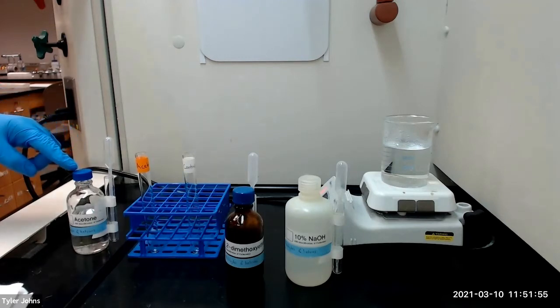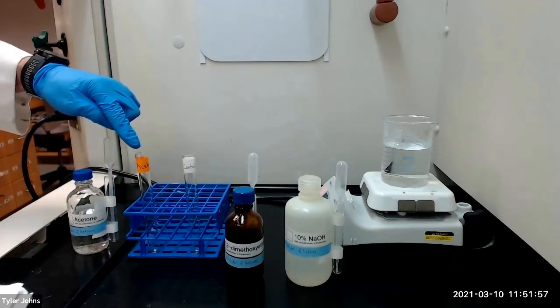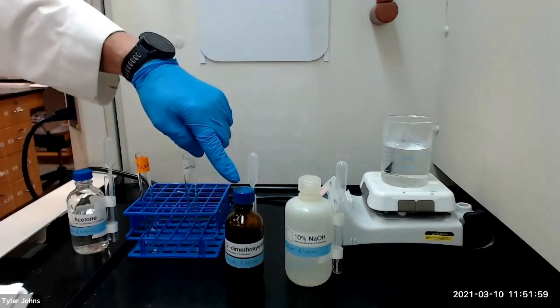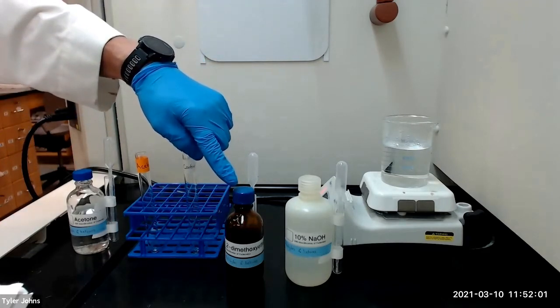We will begin by adding a small amount of acetone to a test tube and then dissolving the acetone in 2 milliliters of 1,2-dimethoxyethane.